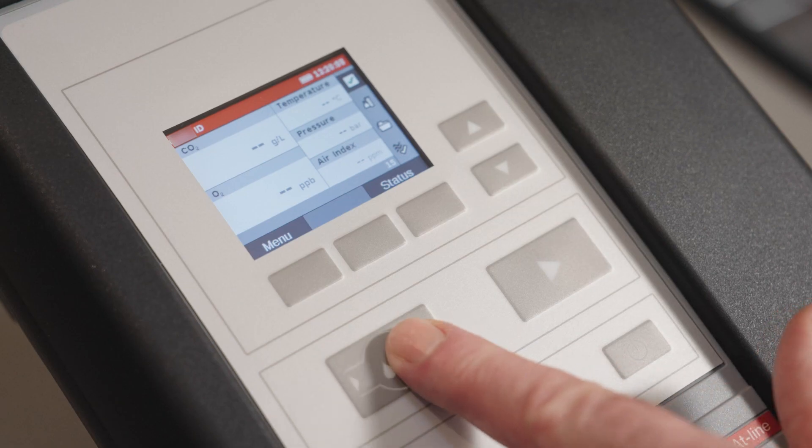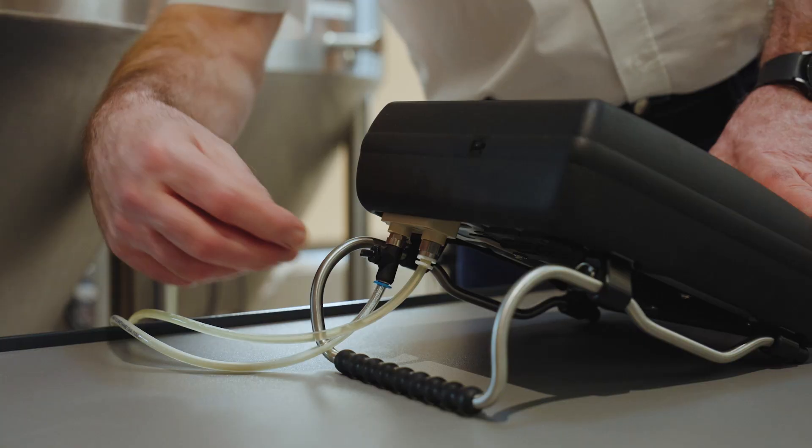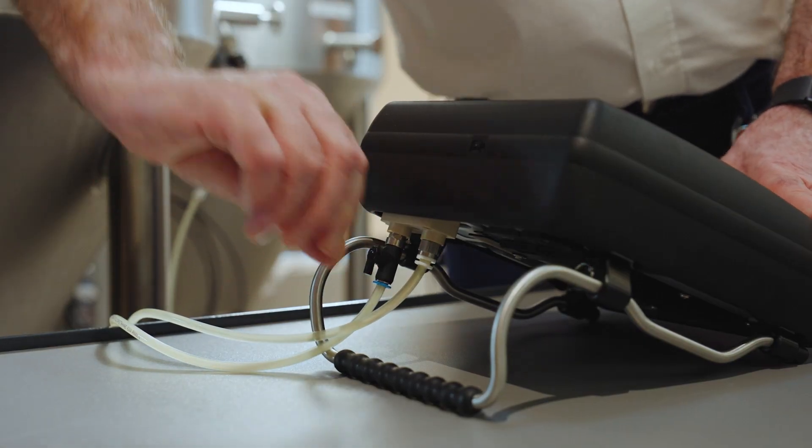Start rinsing. Open the tank sampling valve and the valve at the back of the instrument. Rinse until the temperature and O2 readings stabilize and no bubbles remain in the measuring chamber.